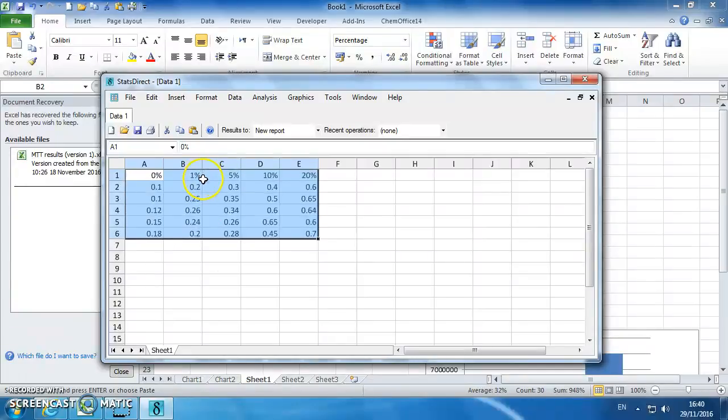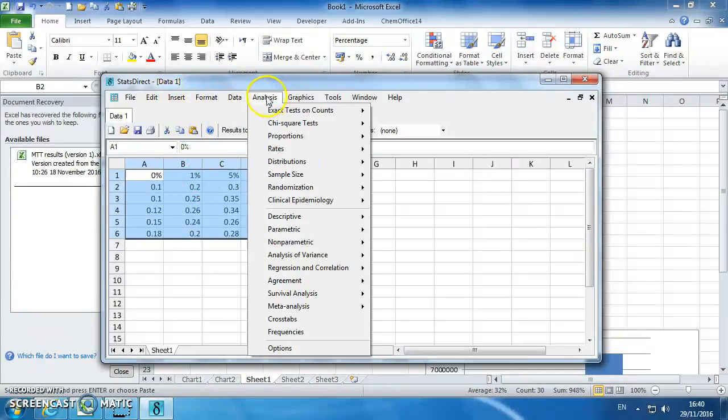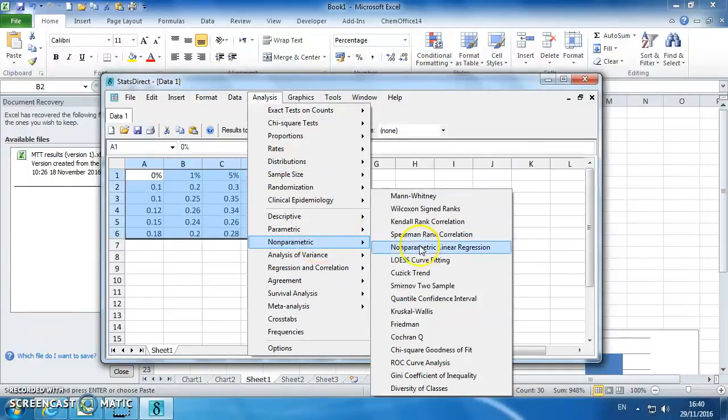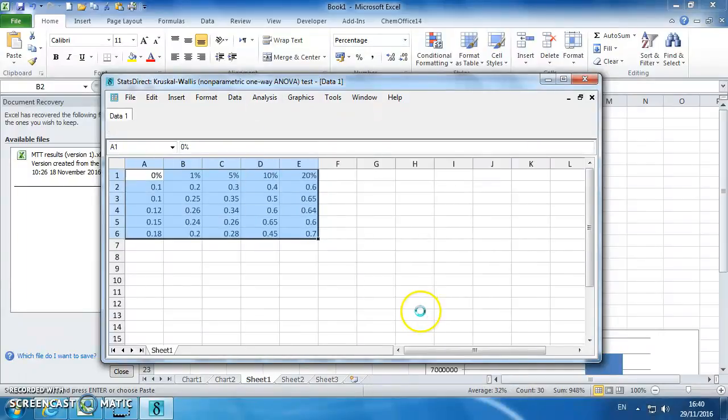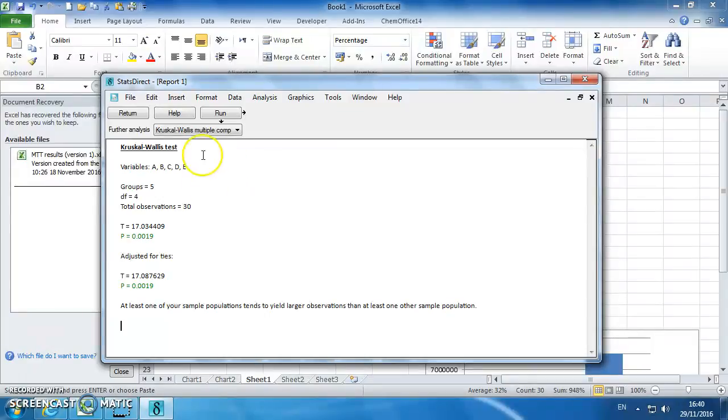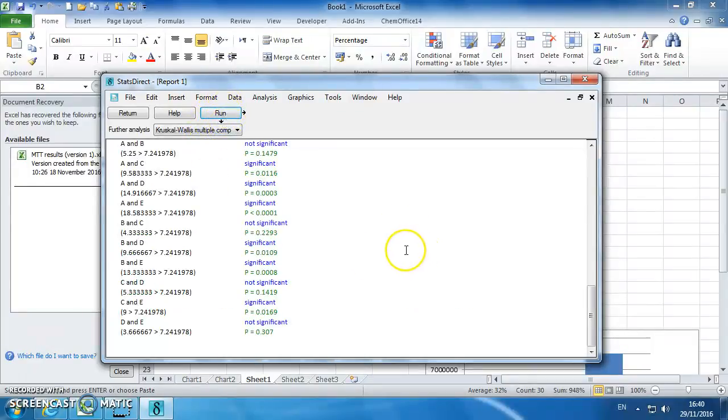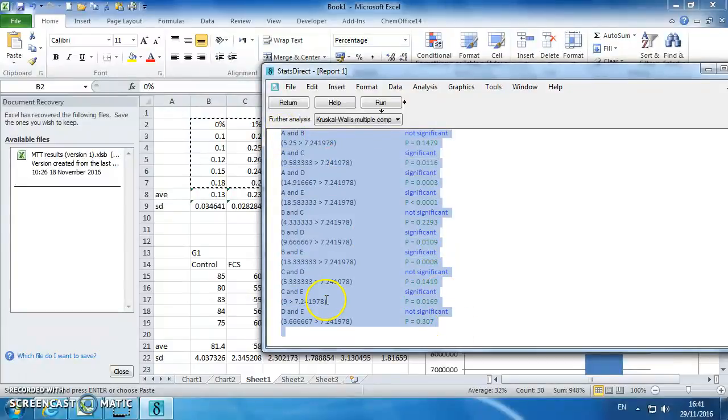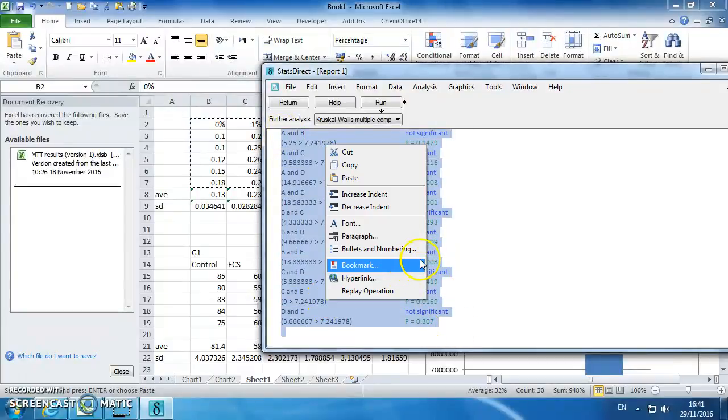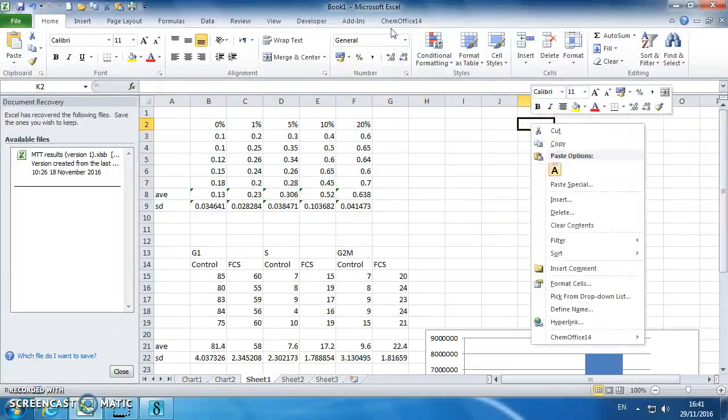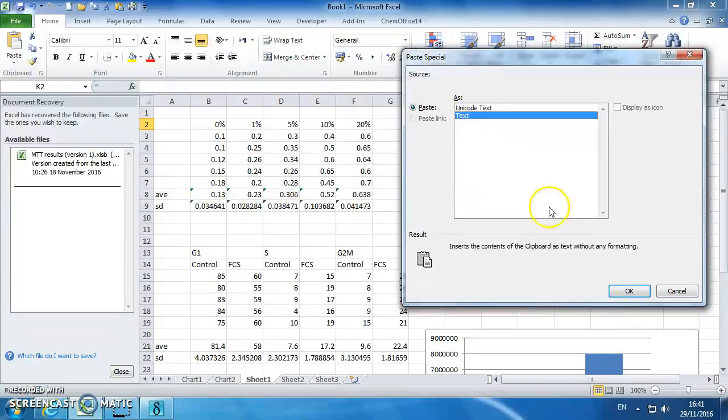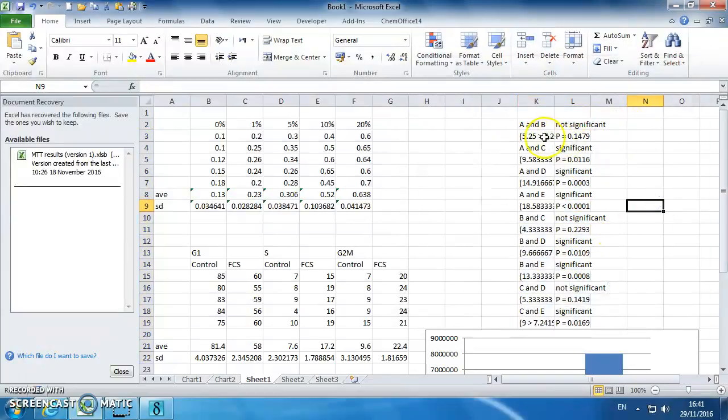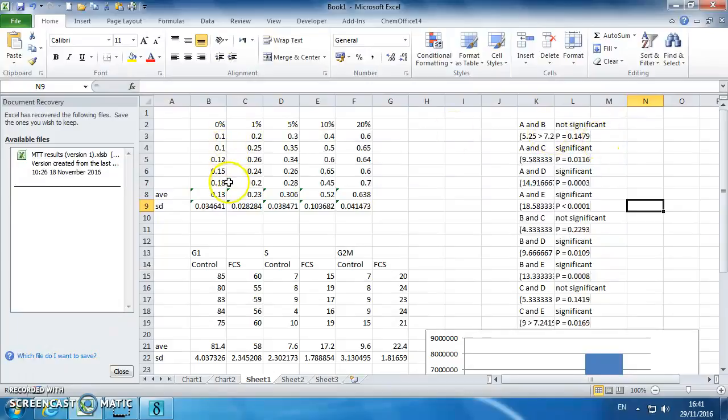So go to analysis, non-parametric, Kruskal-Wallis test, run multiple comparisons. And what we can see is which comparables are, which ones are significant, which ones are not. So I can copy that into my original Excel file, just so I know what's going on.